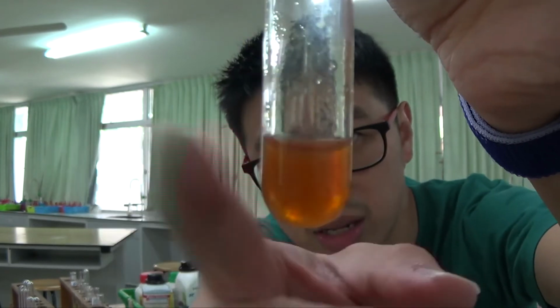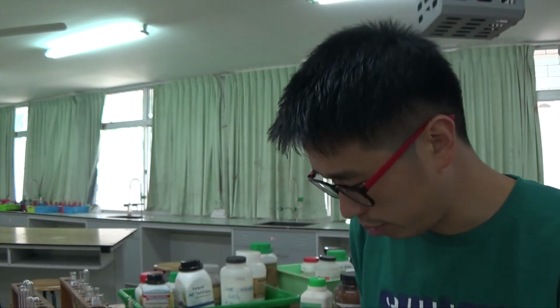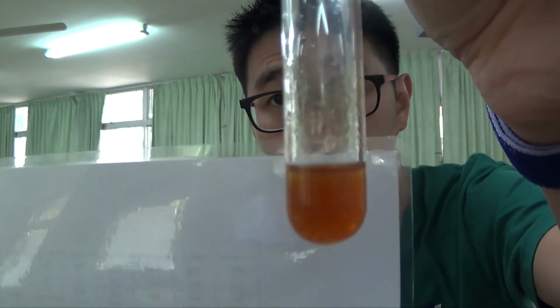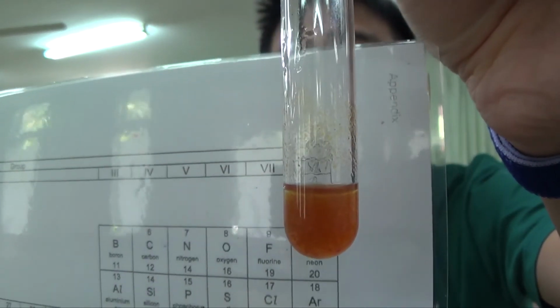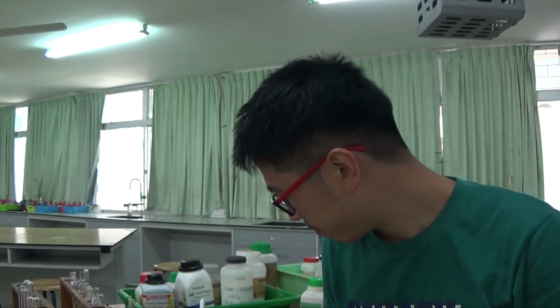You get that cloudiness, you get that precipitate forming. Not too sure how clear it is against my white background, but it is a precipitate. Can you see it does kind of block the writing at the back? So this is also a reddish brown PPT.